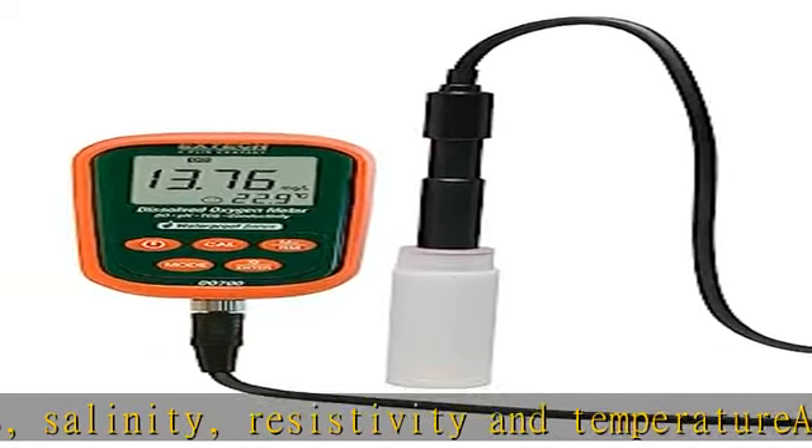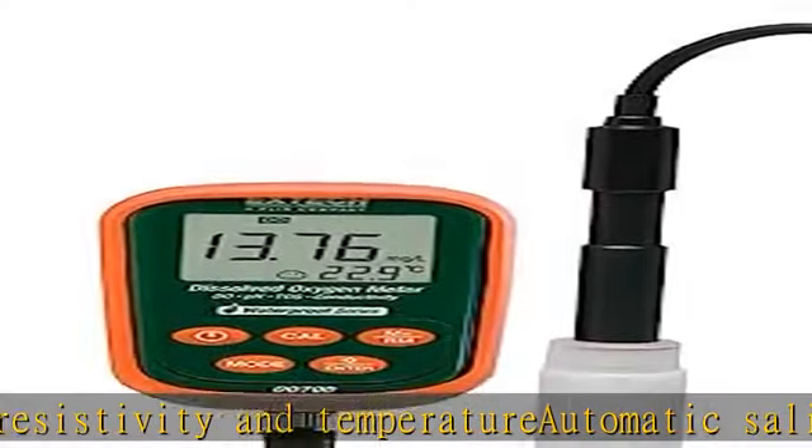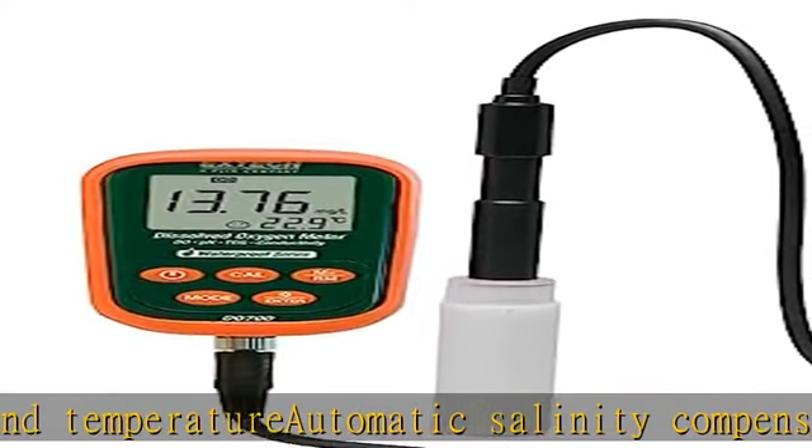Choice of 3-point pH calibration for better accuracy. Check the description to get this product today at the best price.